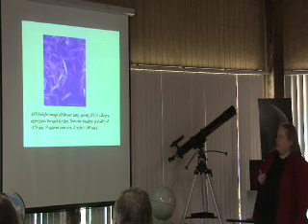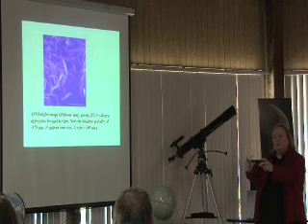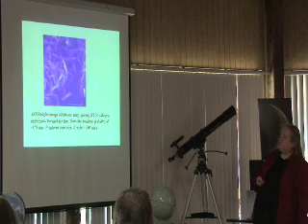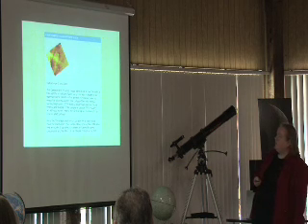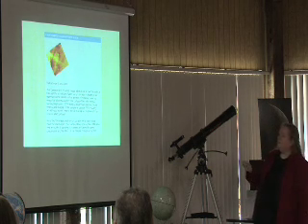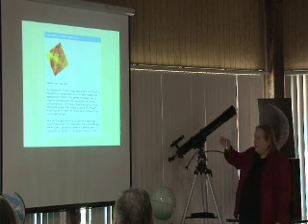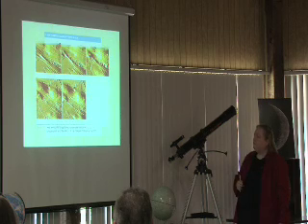This is collagen again. This is a different view of collagen. As you zoom in or zoom out, they look bigger or smaller. But again, you can see the segmented nature of it. And this is another view of collagen fibers on a substrate, where you can see the regular periodic bands that are all spaced the same distance apart.